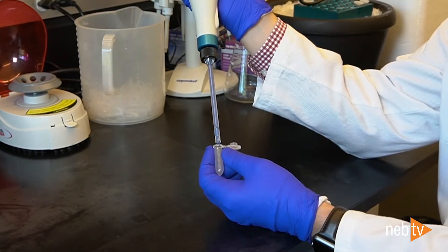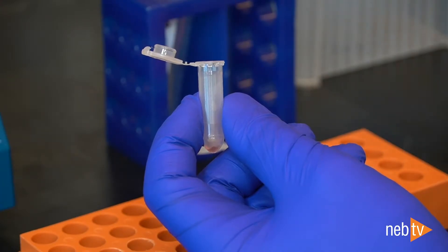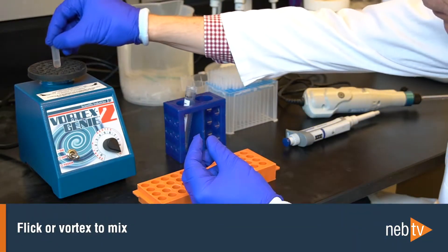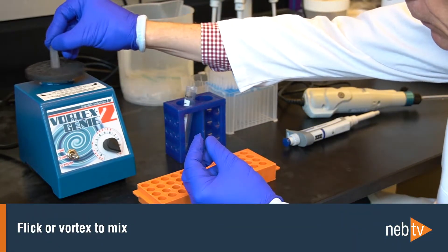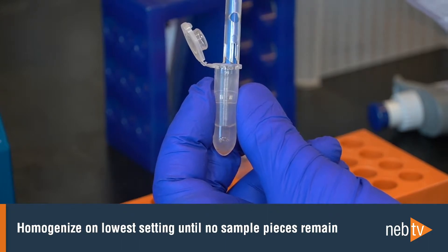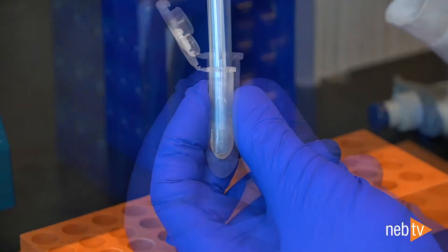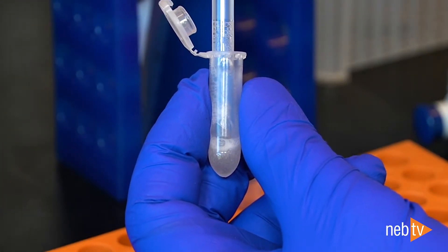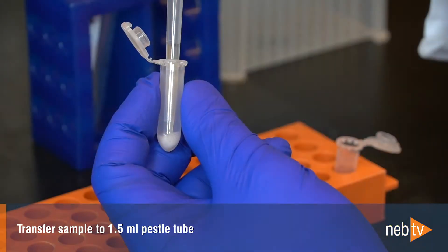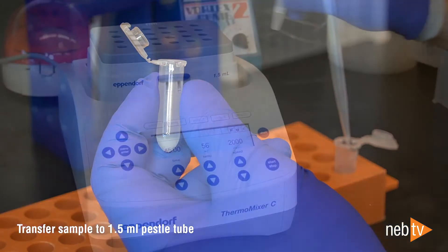Now we will demonstrate homogenization using a rotor-stator homogenizer. Make sure your sample is in a compatible 2 mL tube and add 600 microliters of the Lysis MasterMix. Flick or vortex to mix and make sure nothing is stuck to the walls of the tube. Insert the tip of the probe into the sample and homogenize on the lowest setting until the tissue pieces are no longer visible. This usually takes 5 to 10 seconds. Stop as soon as the lysate begins to foam. Some optimization may be required to find the best conditions for your sample type. Immediately transfer the sample to a 1.5 mL PESL tube using a wide-bore pipette tip and incubate in the thermal mixer.